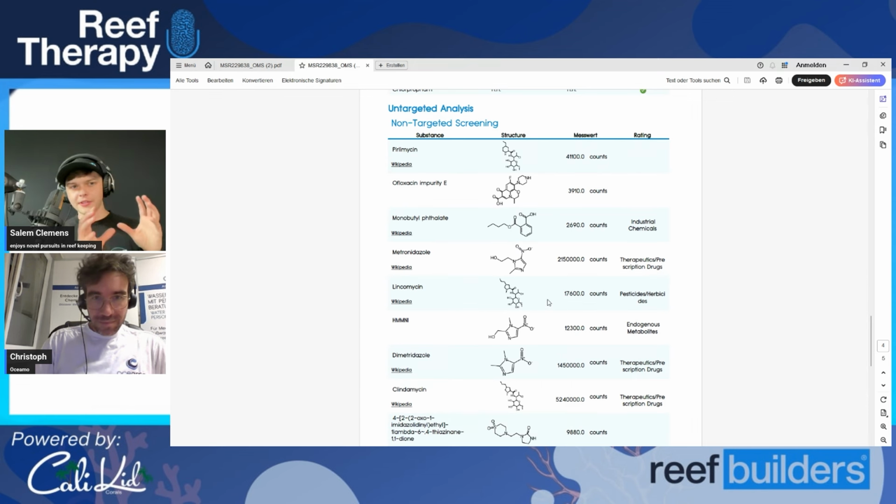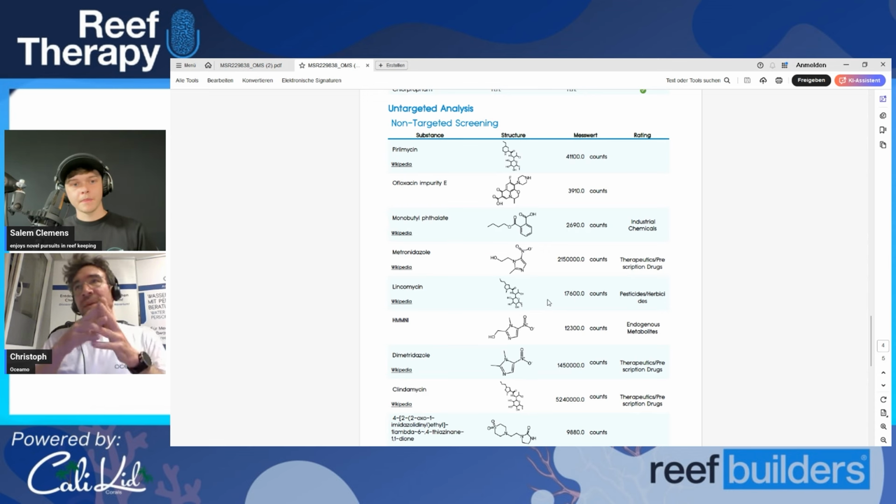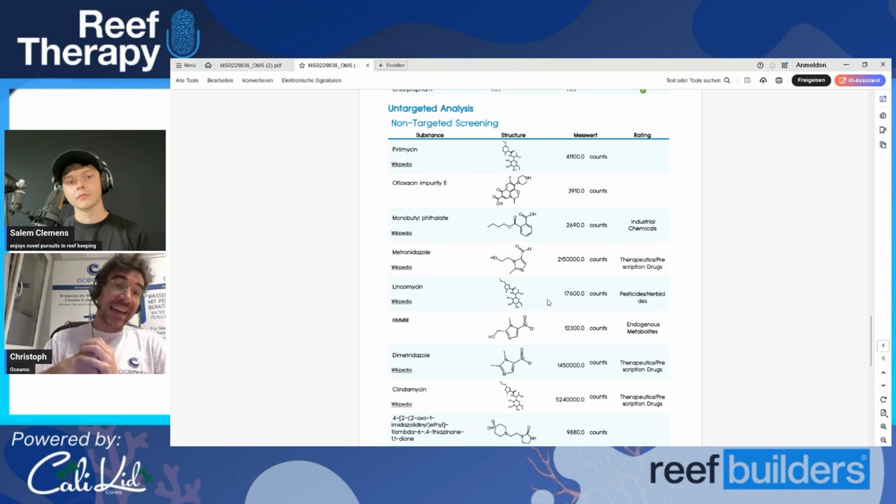Do you have any of the tests? I guess maybe running through some of the sampling, like do you filter the sample, things of that nature? Yeah, I don't have a video with me right now, but it's fairly simple. It's like an ICP test kit, but with a different sample container. This one has very low leachables, because everything the sample sees basically will show up in the analysis.